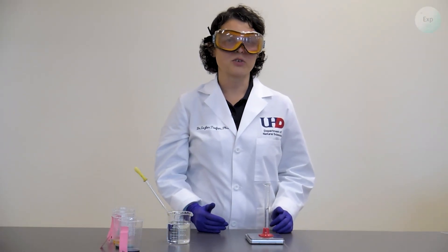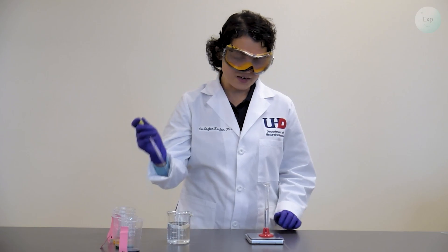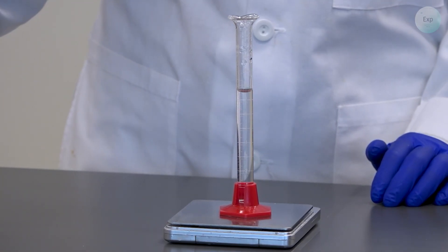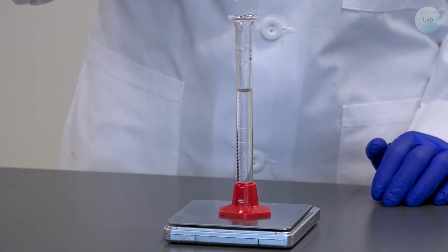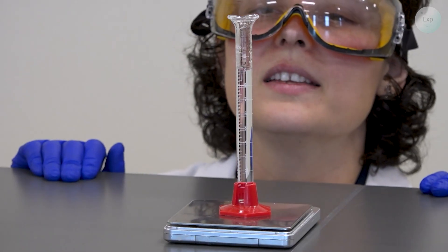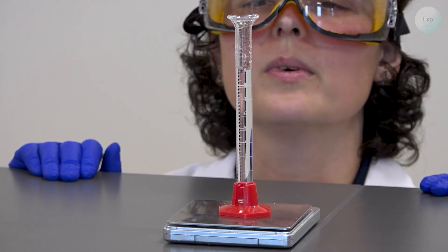And for the third measurement, we're going to add more water. And this time, we're going to aim anywhere between 9 and 10 milliliters because our graduated cylinder does not allow us to read a volume beyond 10. The mass now is 9.15 grams and the volume is 9.12 milliliters.